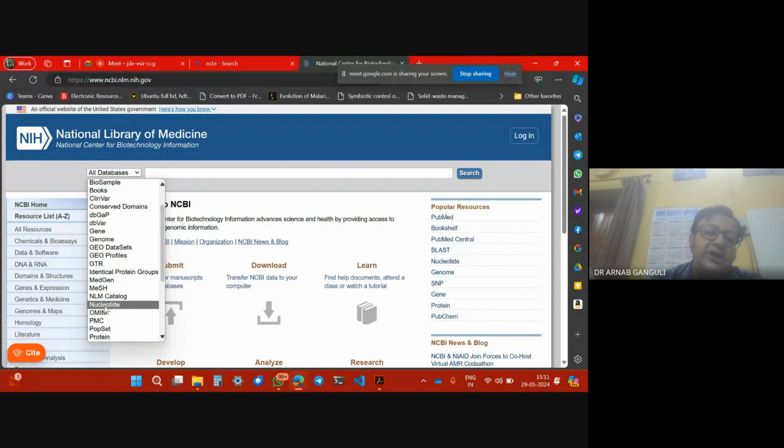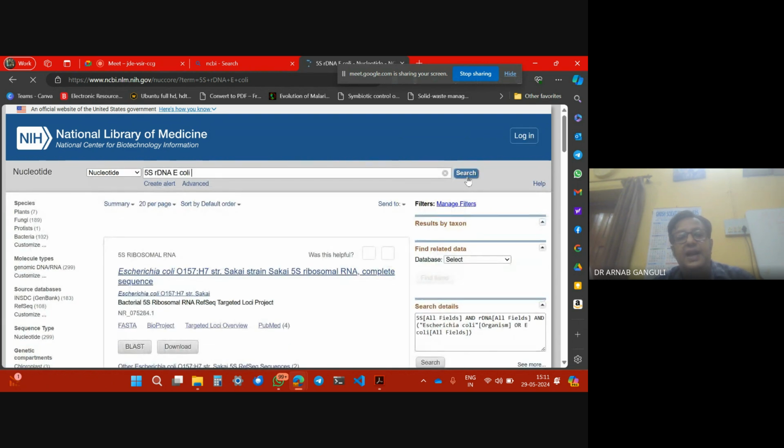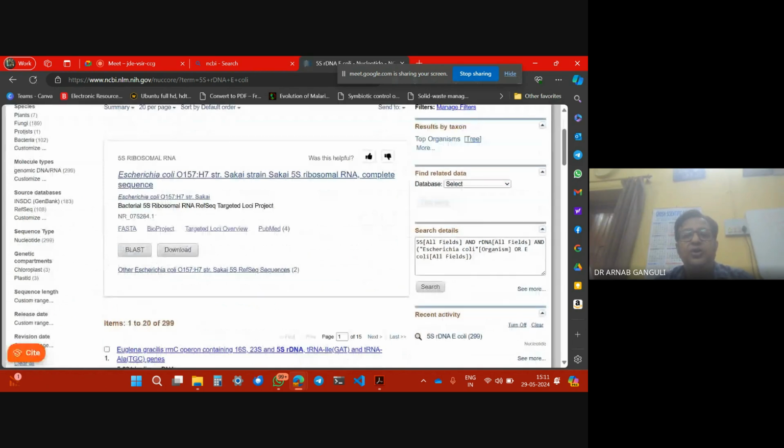So you go to nucleotide. What has he told you? 5S ribosomal DNA sequence of what? E. coli. You just simply type that and you search on NCBI. And now what do you see?